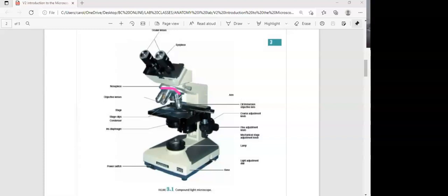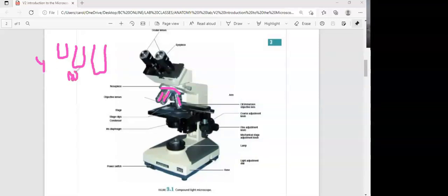And the lenses, let's say, for example, this one magnifies 4 times, this one magnifies 40 times, this one 10 times, etc. They have different magnification, but they can be the same size. One of them is going to be like this, the other like that, because they're going to have more magnification. Let's say 4, this is going to be 10, and this is going to be 40. We can have another one in here even longer, maybe this is 100, and you're going to get more magnification.